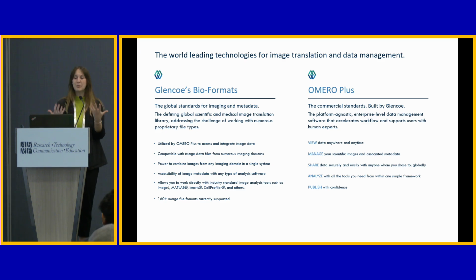And so as I said, OMERO Plus uses Bio-Formats, and that's how, when I say that you can view and share and analyze your data, you can do that for all the various data types that are acquired across numerous core facilities, because of a tool like Bio-Formats and the support for various vendors' proprietary file formats and open standard file formats as well. Okay.